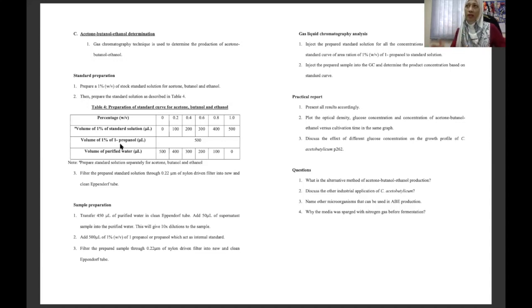If you have only one spectrum, that means your sample has some problem, so you need to re-prepare your sample. It is an indicator to show whether your sample is prepared and stored correctly or not.